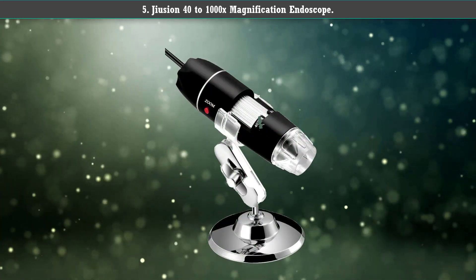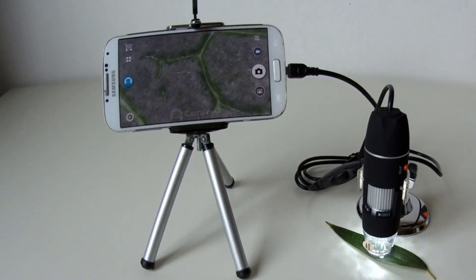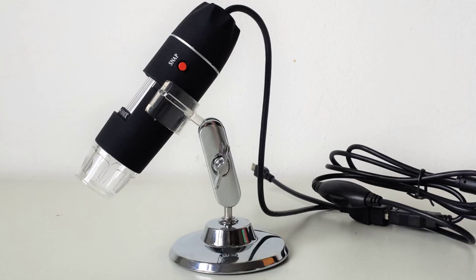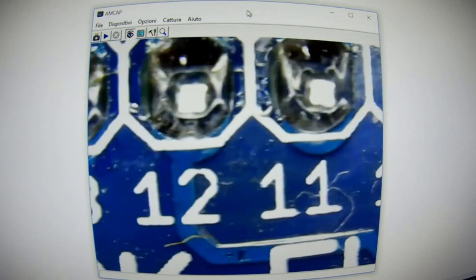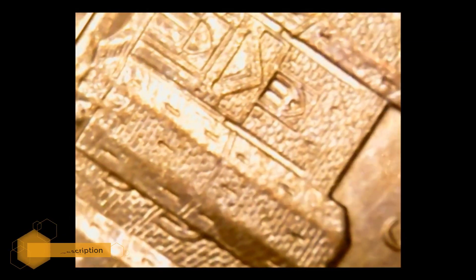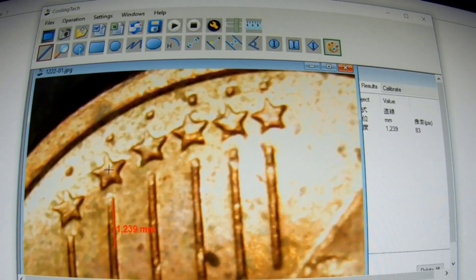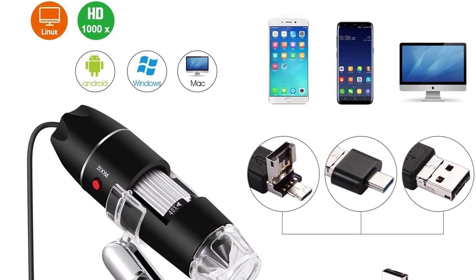Number 5: Jiusion 40-1000x Magnification Endoscope. This is the Jiusion dual purpose microscope and endoscope, which has a magnification range of 40x to 1000x. You can also use this microscope to view dark areas and objects. It's compatible with a variety of devices, including desktops, laptops, tablets, and smartphones. It has a decent frame speed and focus range, as well as a refined focusing ability to get you the clearest images.